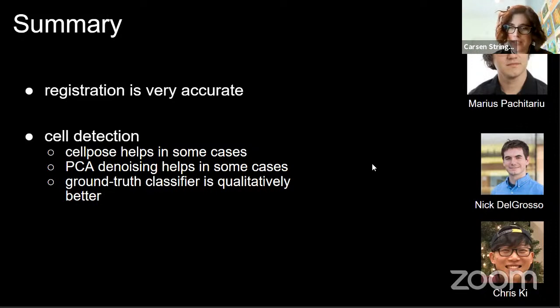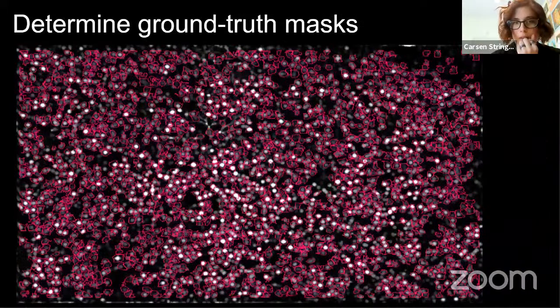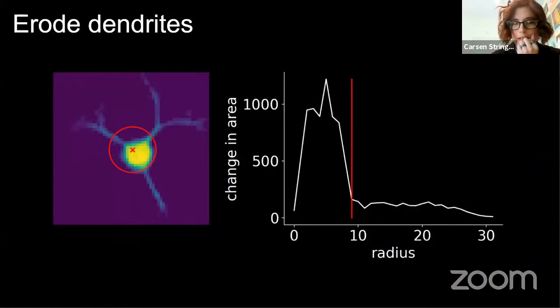So maybe this will answer your question. We now have this logical that comes out of the stat file, for people who are familiar with the Suite2P output, that will tell you which pixels I cropped when I did my soma crop. Are those the pixels you're looking for? Pixels that are not in F or F new.